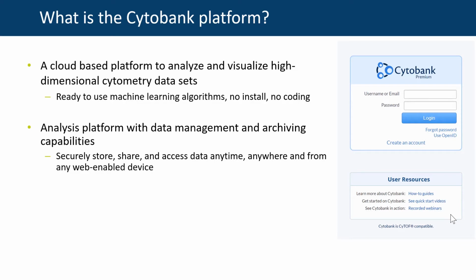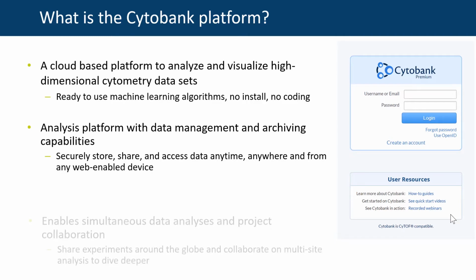What that means is we can access that anytime, anywhere from any web-enabled device. So if I wanted to get on my iPhone, I could go ahead and grab my Cytobank experiment on my iPhone. I can access it from my iPad, from my laptop, from my PC, and I'm going to be able to store, share, and do analysis on that data anytime, anywhere.